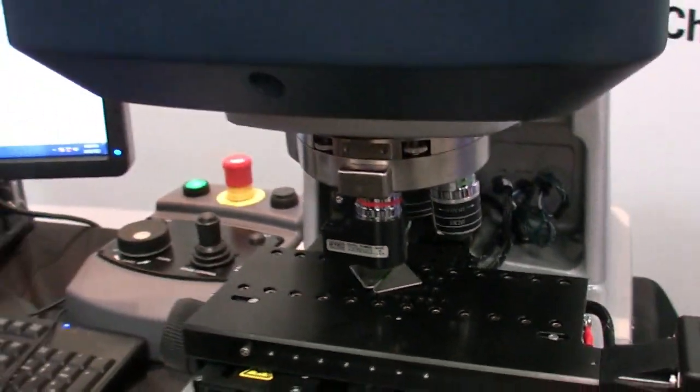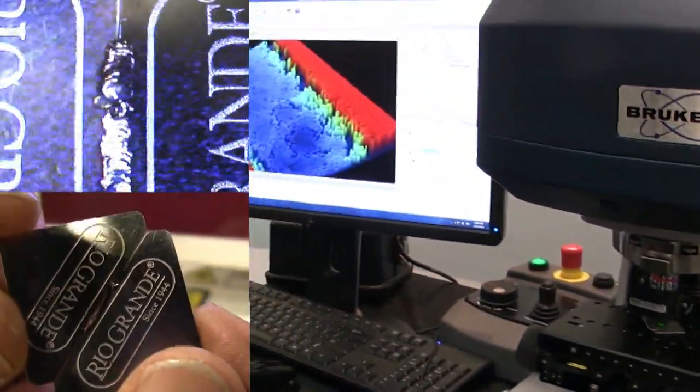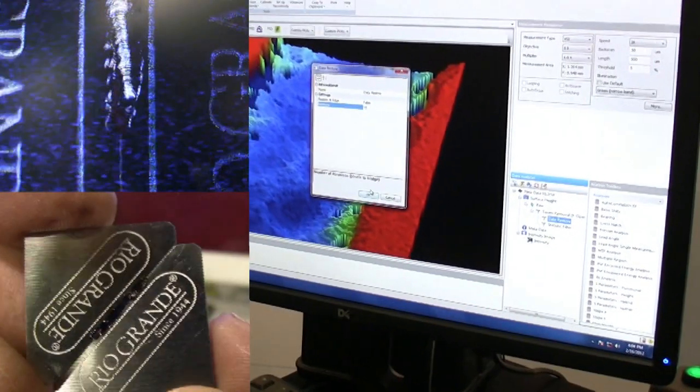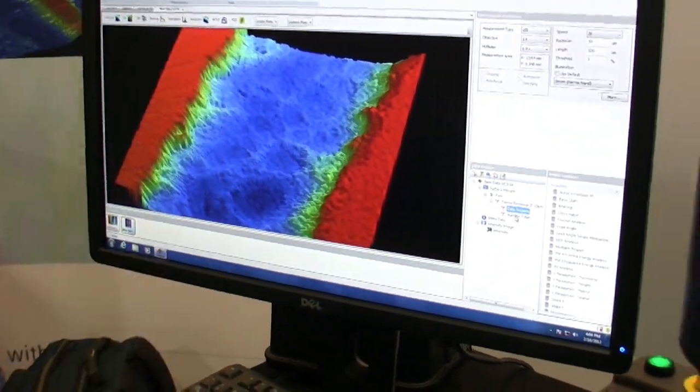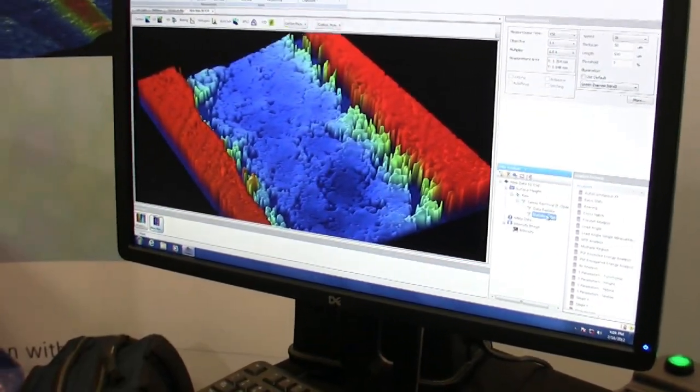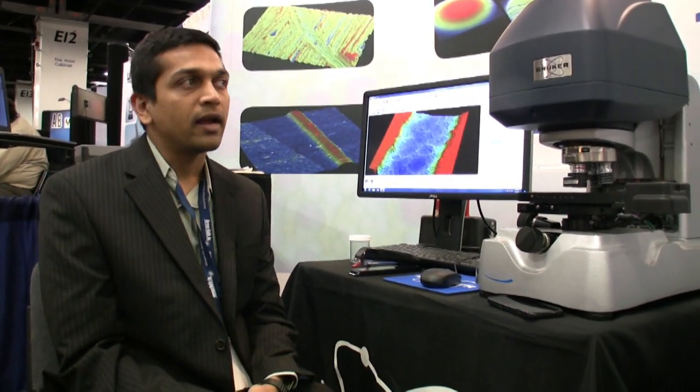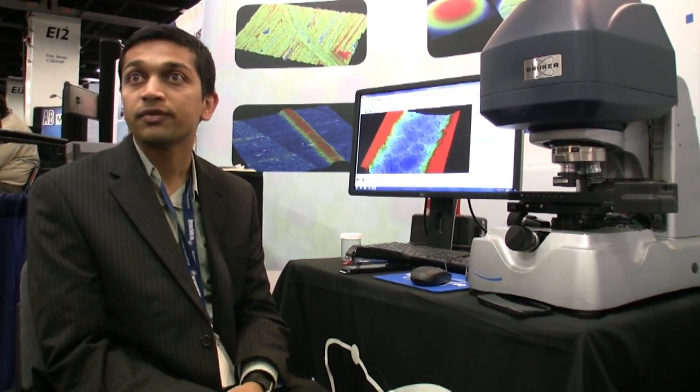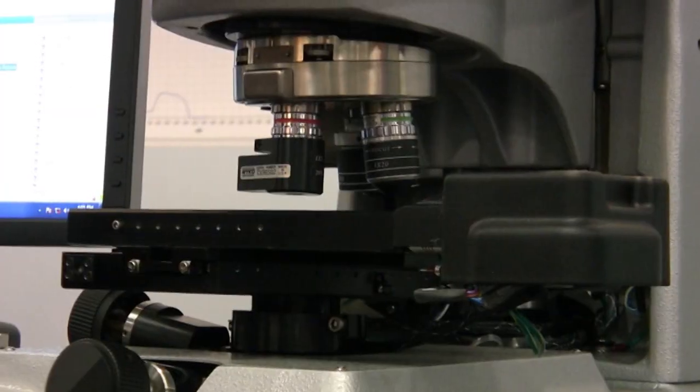We are looking at a 3D surface profile of a welding joint that you guys brought in. It uses white light interferometry to make a 3D topography measurement of the surface. It's a very precise measurement - the resolution is down to single digit nanometers, and you can measure very large objects up to 10 millimeters. It's a very wide range, a very large dynamic range of measurements.